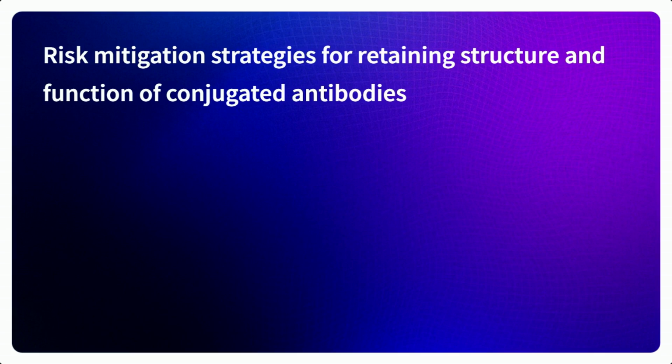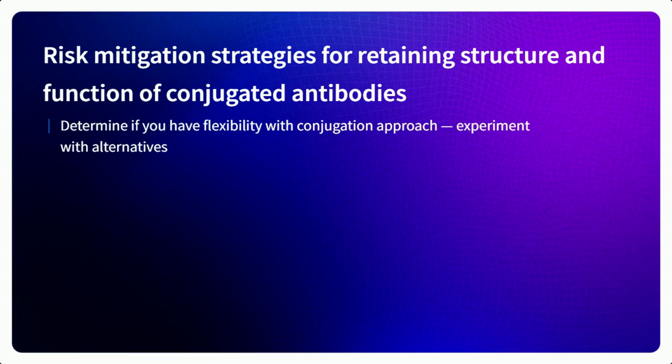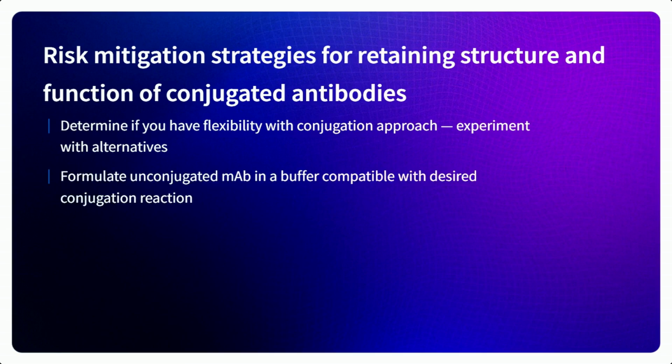Now, to wrap up, I want to offer some practical solutions for reducing the destabilization risks of your ADCs. So when thinking about the practical considerations of building an ADC, it's critical to consider the stability of the antibody throughout the duration of the conjugation process. If you're starting from scratch, be sure you fully understand how the unconjugated monoclonal antibody behaves, both in the formulation and conjugation buffers.